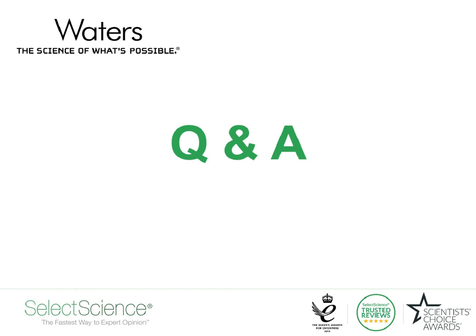Lovely. Our next question is for John. It's a two-part question. The first part is, have you used nylon membranes in DESI imaging? And the second part is, have you ever used fungi for DESI imaging? Can we use fungi in DESI IMS, although they produce spores and may contaminate the system?